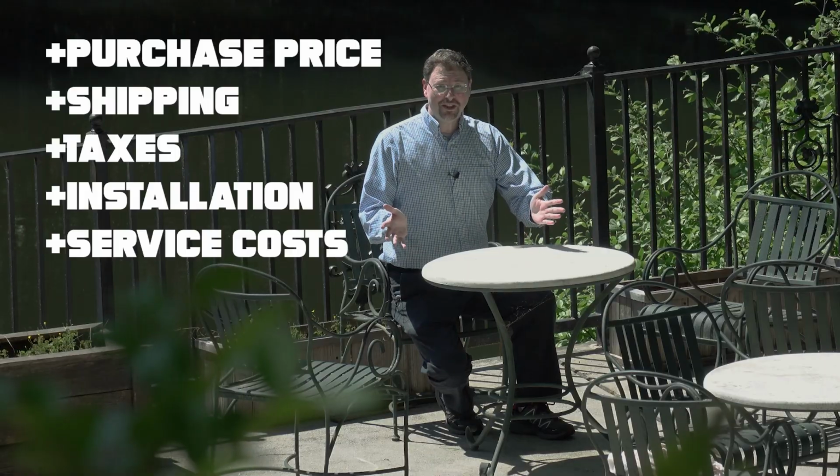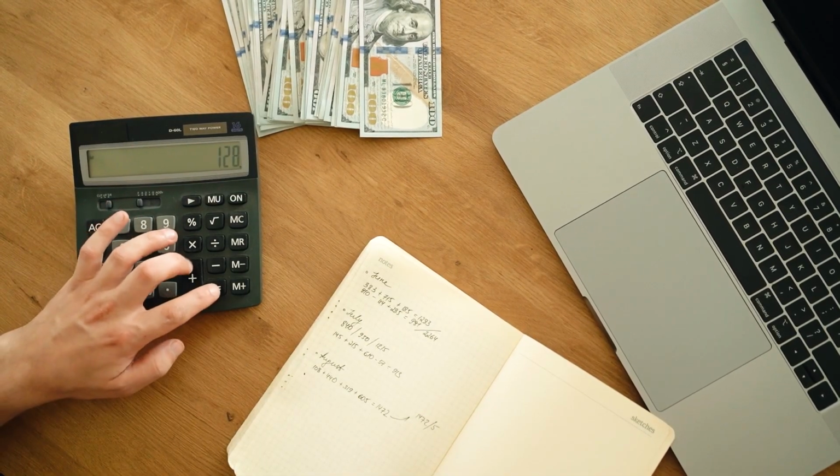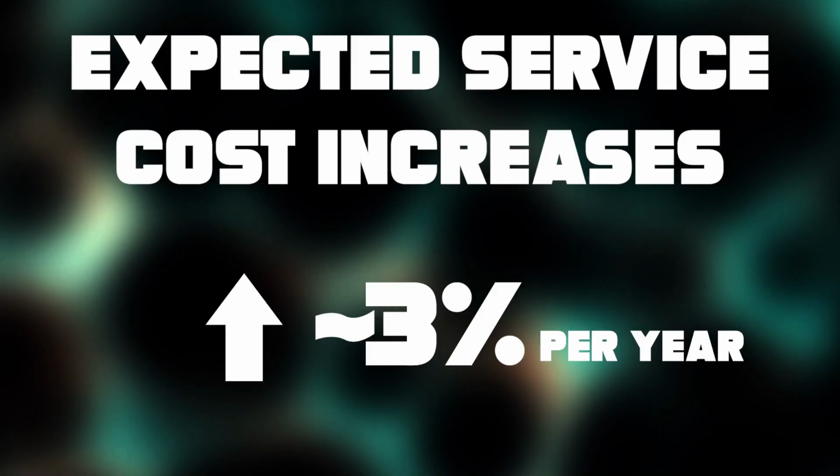So, what do we want to do with these numbers, and what do they give us? Well, we're going to take all of these numbers, we're going to add them all up so that we can estimate the costs of owning the instrument over 5 and 10 years. Usually, the vendor won't be able to give you exact costs for the service agreement that far ahead of time because it's in the future, but they can give you an estimate. Normally, service costs will increase by 2 to 3% per year, depending on economic conditions.